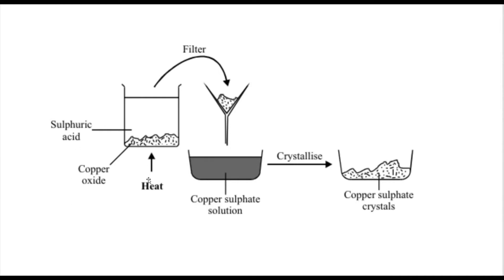Then you add excess copper oxide, which will react with the acid. And then you filter this off, and over here you get your copper sulfate solution, which is quite dilute, full of water. And we're going to evaporate the excess water off by a process known as crystallization. And to do this, we need to provide a heat source.